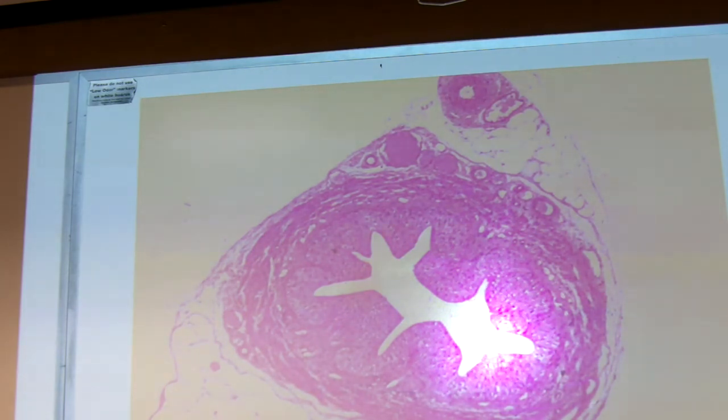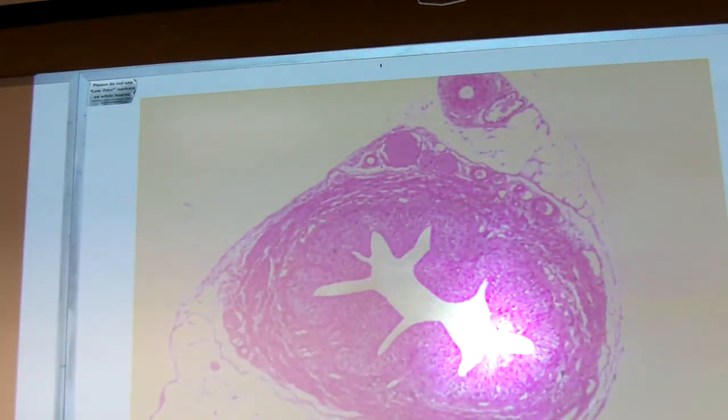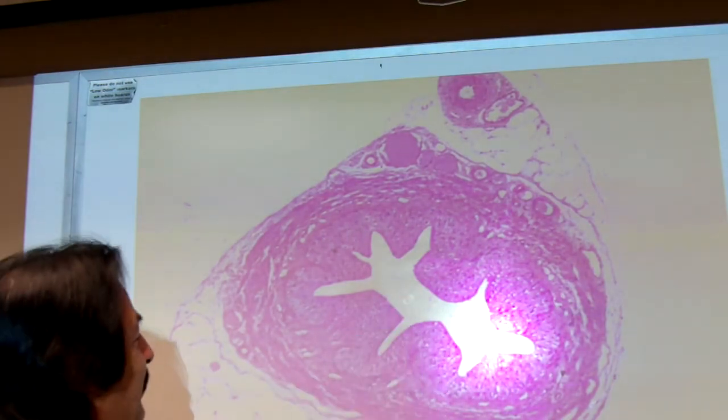No? All right. Our last epithelium, called transitional epithelium. According to your book, where do you find transitional epithelium? In the urinary bladder, okay? Your pee tank, all right? This pee tank is empty, obviously, okay? But here's the lumen right here.